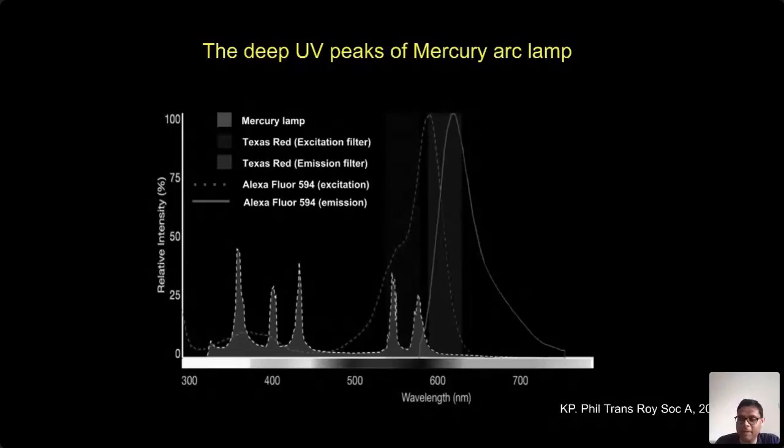sequential correlative super resolution imaging. The thing is, modern microscopy is moving towards 1 nanometer resolution, but I believe we should be developing correlative methods, so that if you identify a structure with a SIM or a STED microscope, you can independently identify it with a localization microscope. This is very important because most of the structures we don't know.